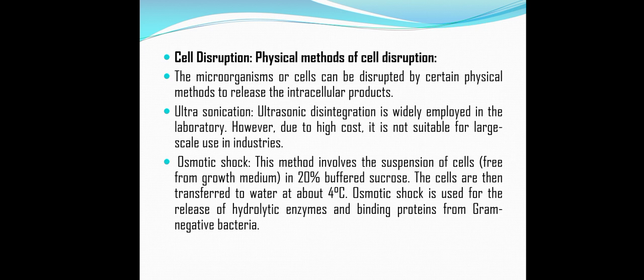Within ultrasonication, high intensity sound waves are utilized for making vibrations within the microbial cells, which results in the disruption of the microbial cells to release the intracellular product. Now the next one is the osmotic shock.